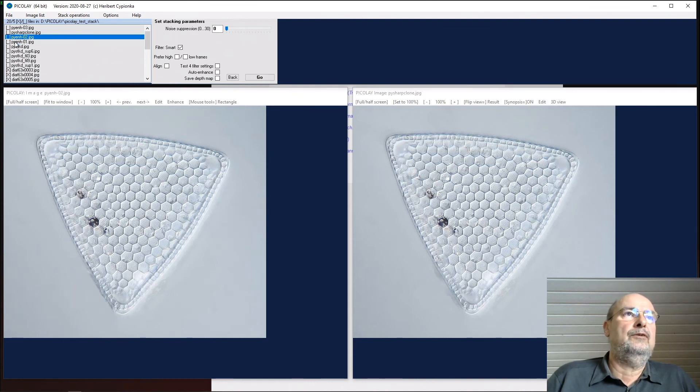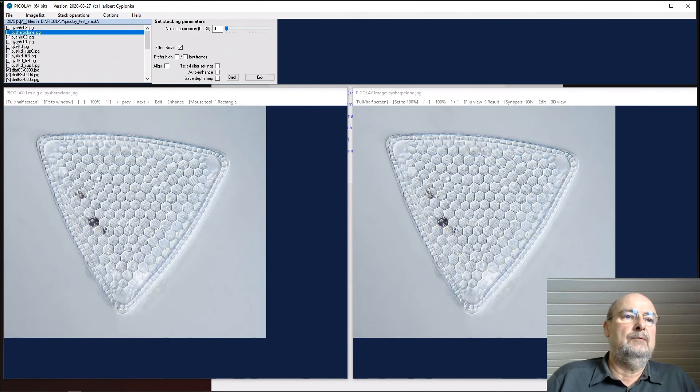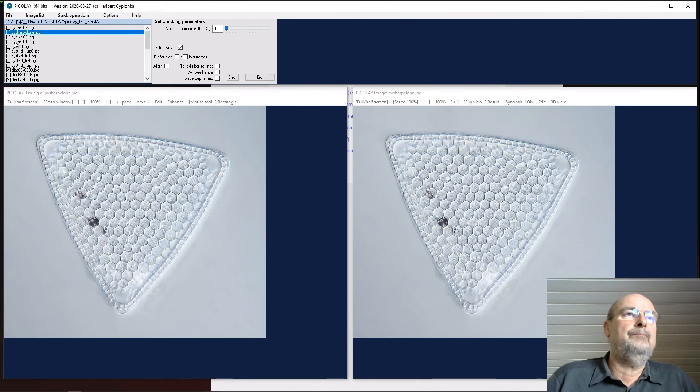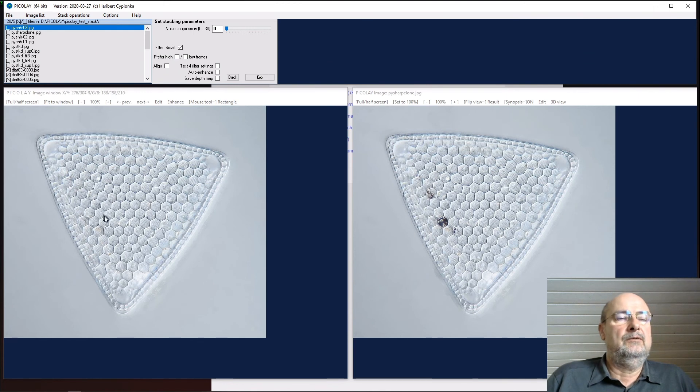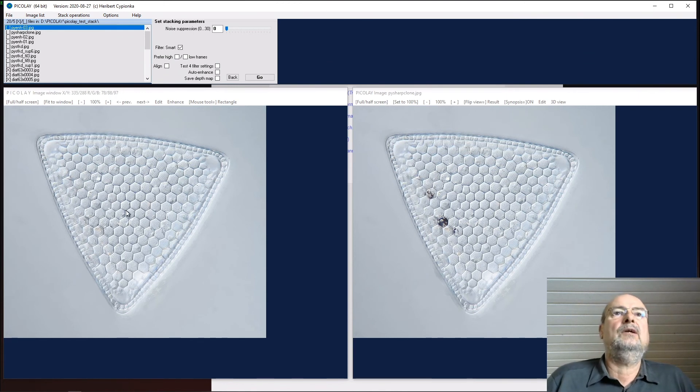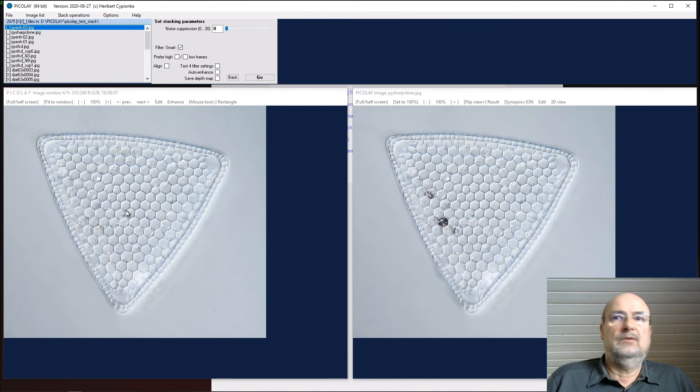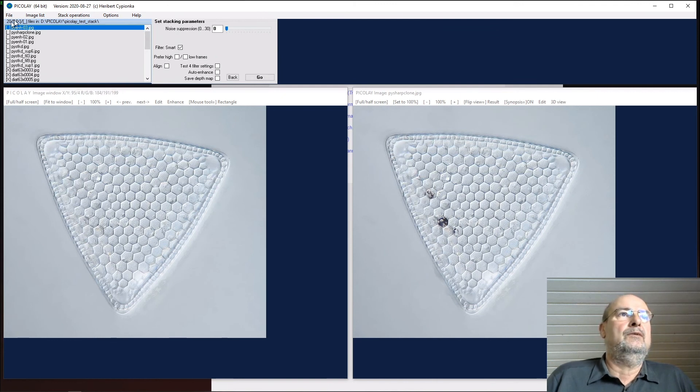We had this first trial to remove it, then we did it with the cloning from the originals. Then we cleaned here, here, the edge, and removed these artifacts. Now we have a nice stacked image that we can save and rename it.